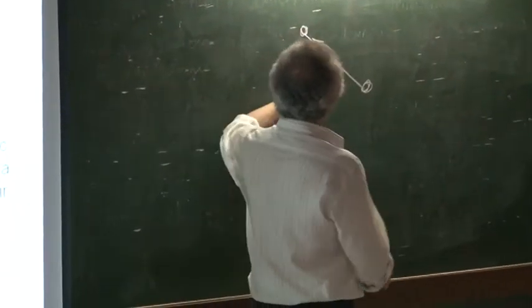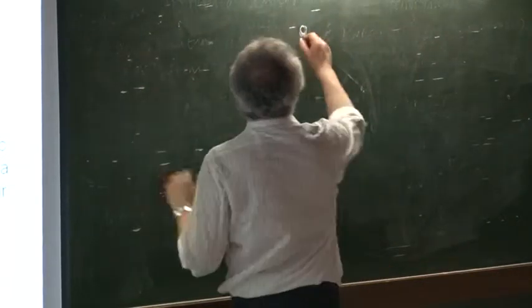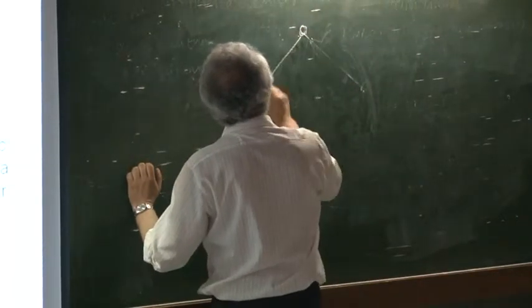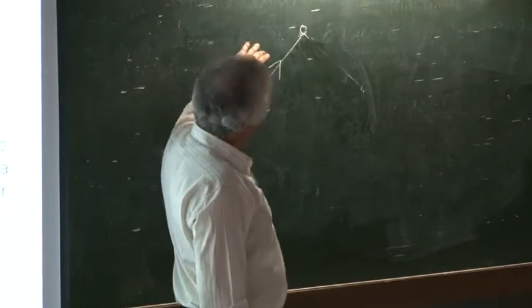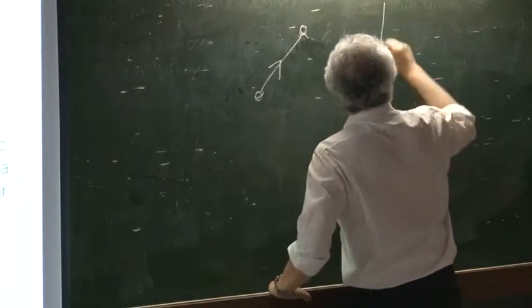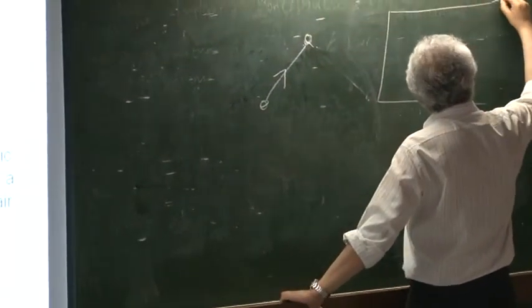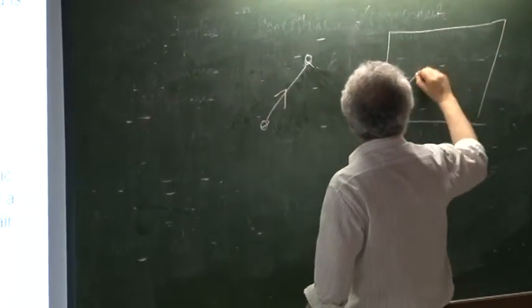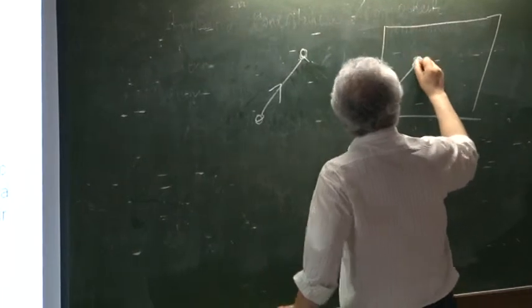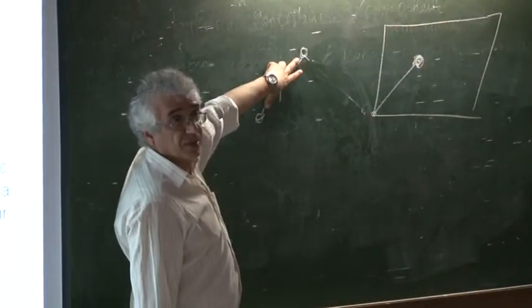So if I take that vector and I have a unit cell, let's say, and I reproduce that vector in the unit cell from the origin, then I'll get a peak there in the vector map that corresponds to this vector.